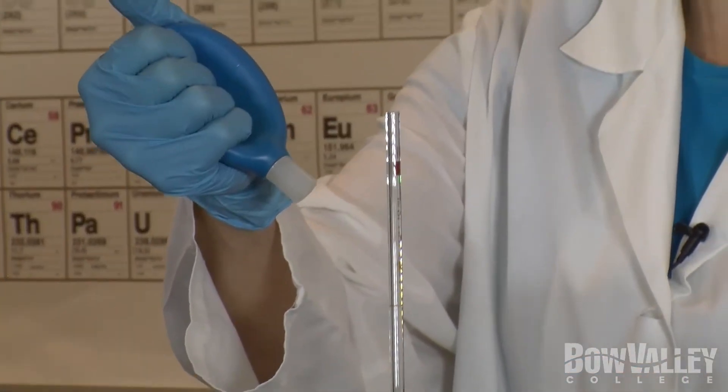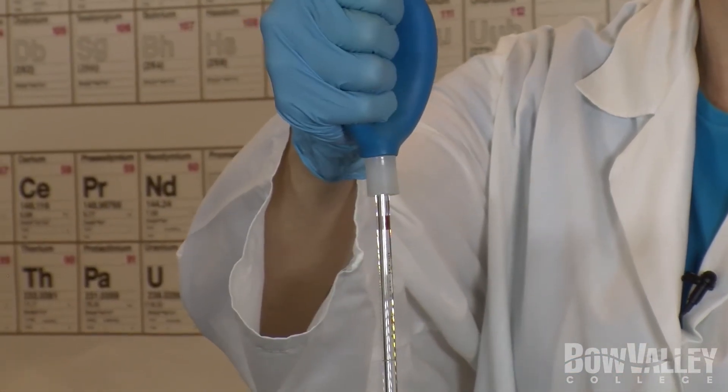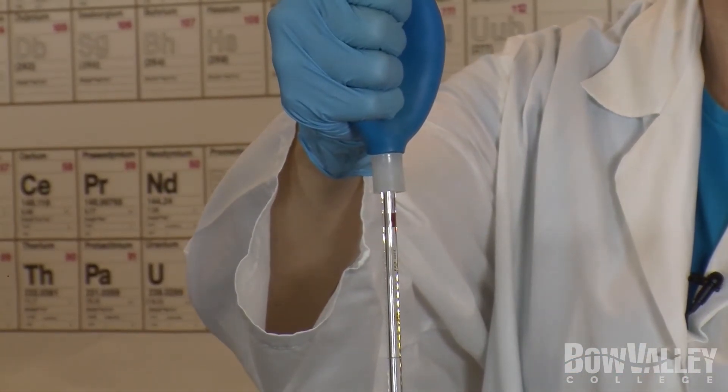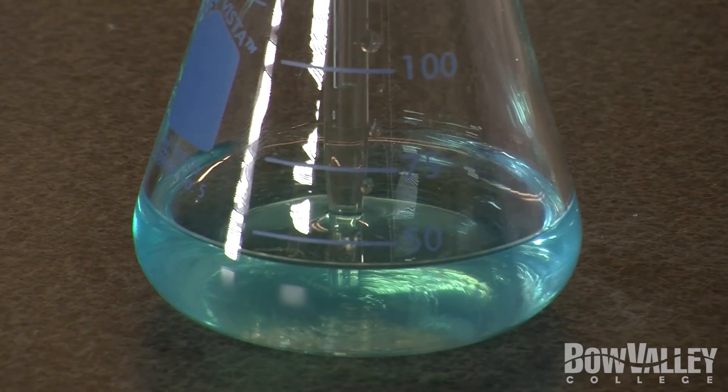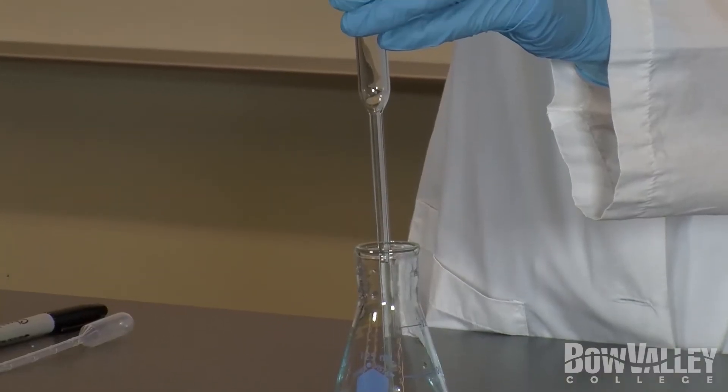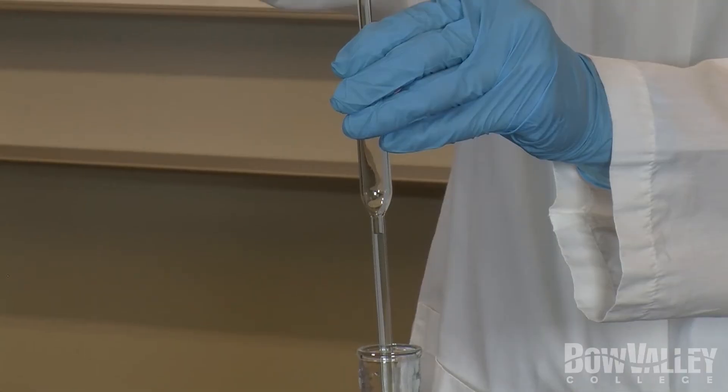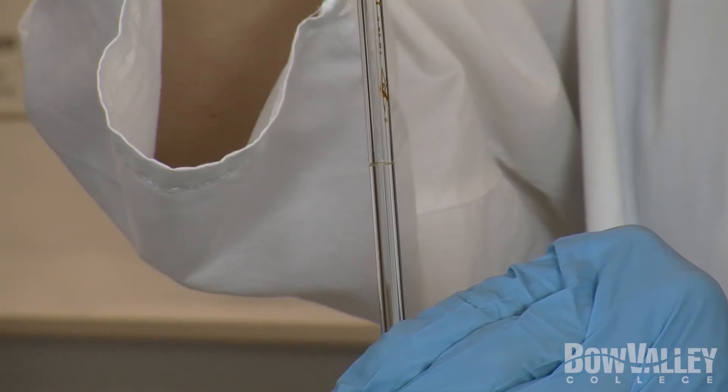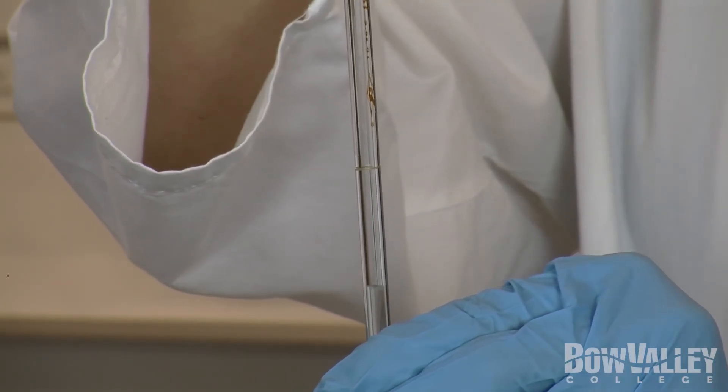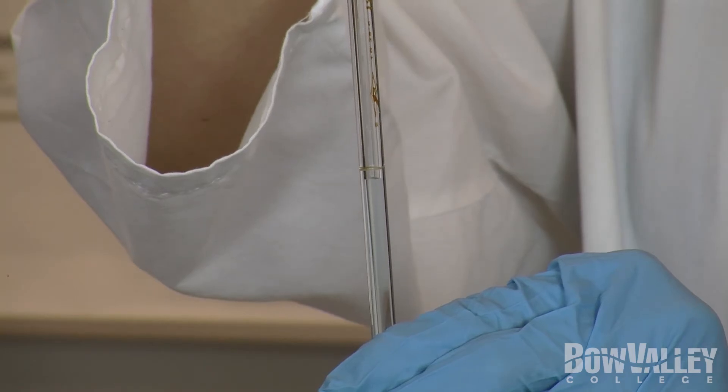Squeeze the pipette bulb, then securely place over the end of the pipette. Slowly release your grip on the bulb and allow the liquid to rise up the pipette. You should allow the liquid to rise above the line marked on the pipette, but stop before the liquid level reaches the bulb.